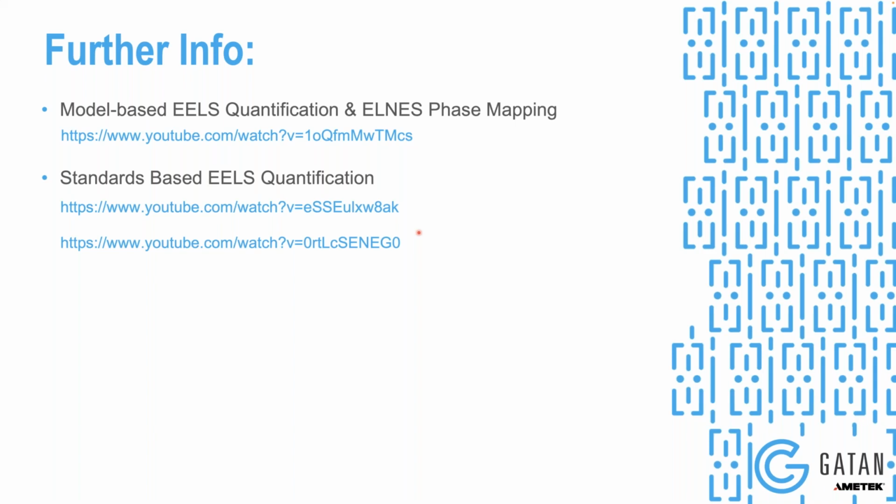because it can be done with a log ratio based approach, the log deconvolution or log convolution approach. We have the low loss spectrum. Yeah, it works just fine.